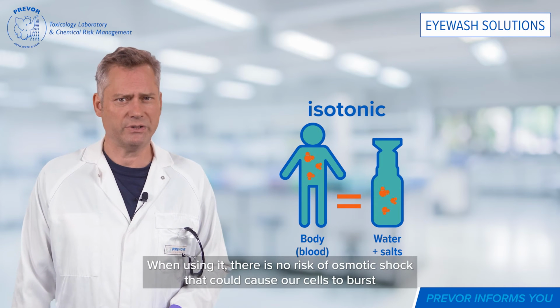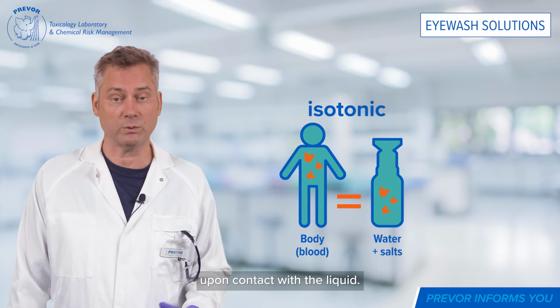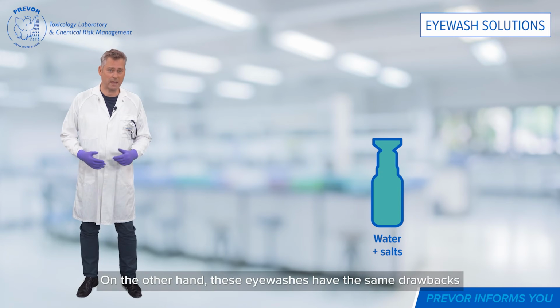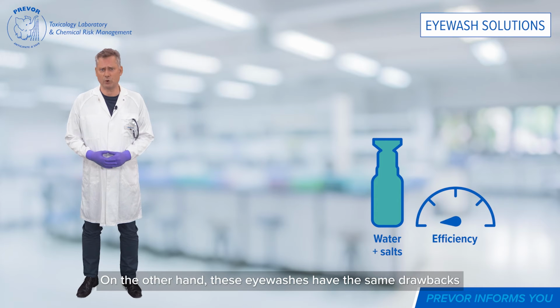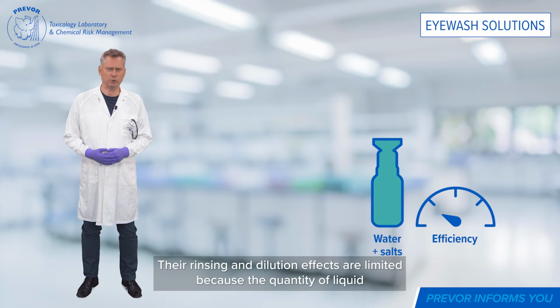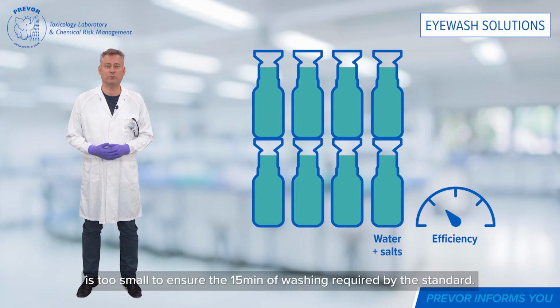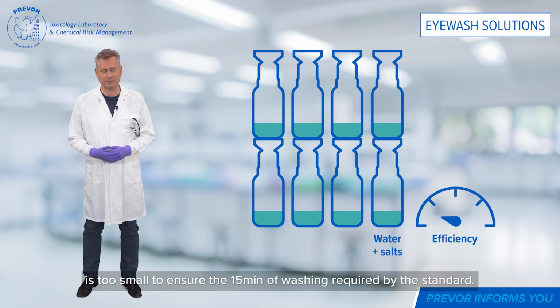When using it, there is no risk of osmotic shock that could cause our cells to burst upon contact with the liquid. On the other hand, these eye washes have the same drawbacks as the bottles containing sterilized water. Their rinsing and diluting effects are limited because the quantity of liquid is too small to ensure the 15 minutes of washing required by the standard.